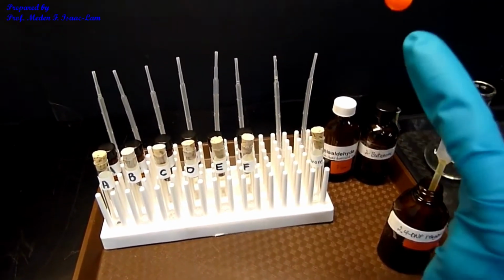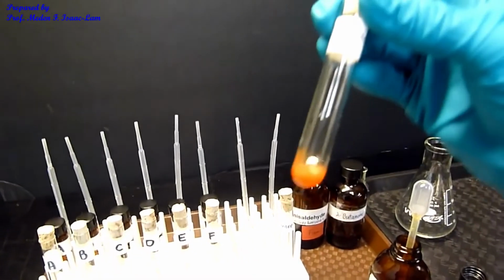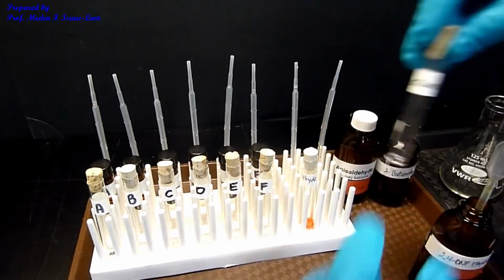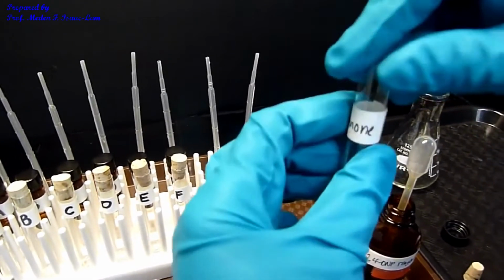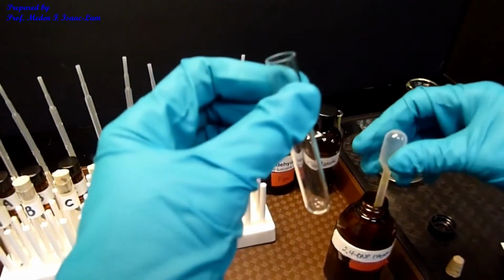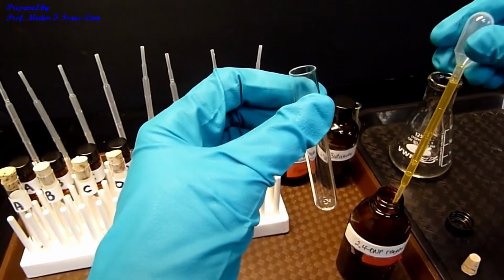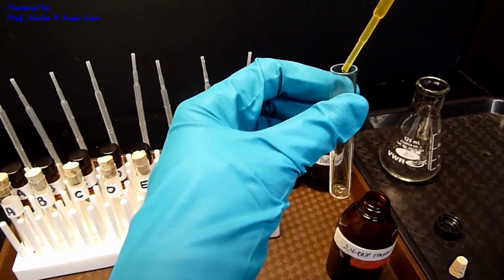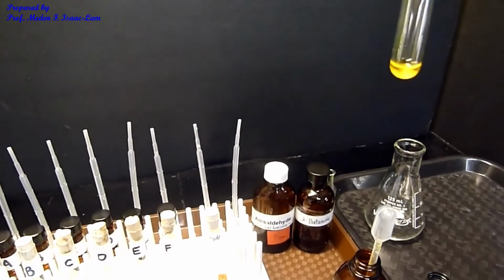Shake a little bit so there's an orange precipitate. It's an orange precipitate for the aldehyde. And then 2-butanone. Again, 10 drops. You can see precipitation at the bottom. It's yellow this time.